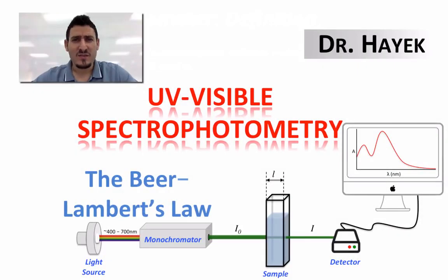This is Dr. Hayek, and this video is about UV visible spectrophotometry. In today's video, I'm going to discuss the Beer-Lambert's law.